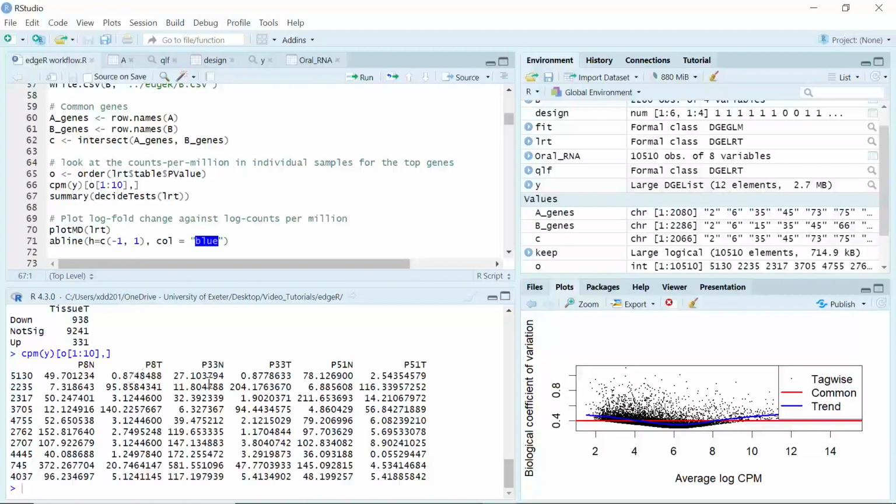You can see the same pattern in the other two patients. Then the second gene, you can see it has no expression in normal tissue, then it is upregulated in the tumor tissue. Once again, you can see the same pattern for this gene expression in patients 33 and 51.